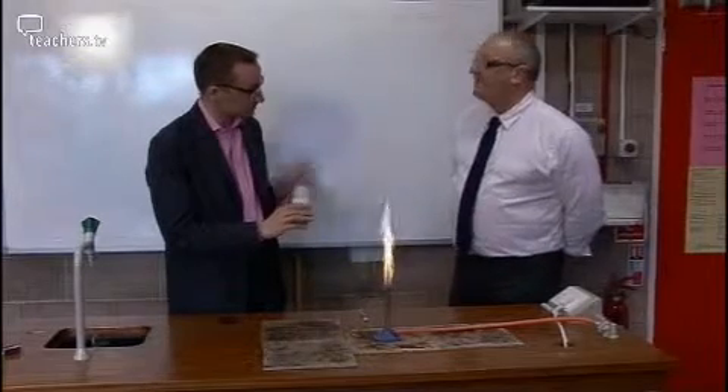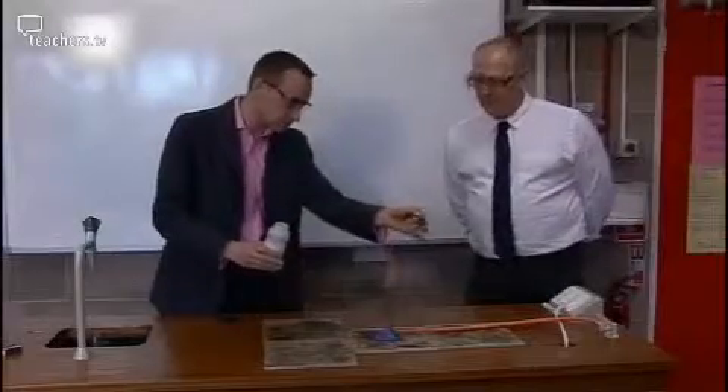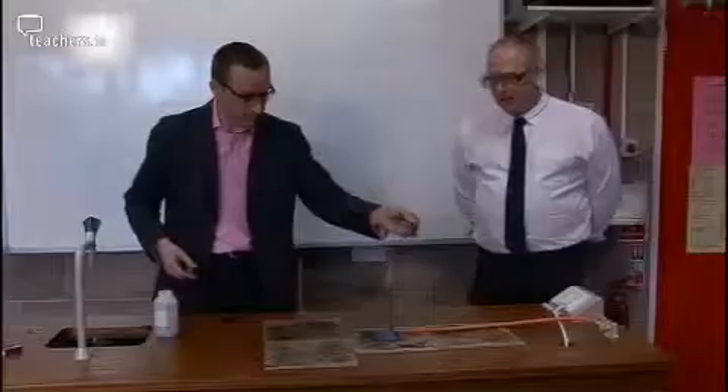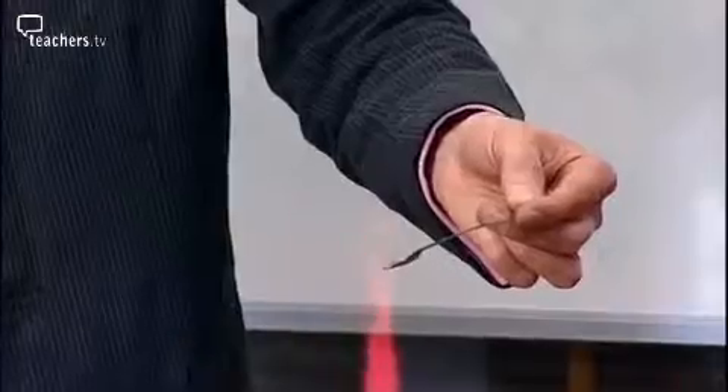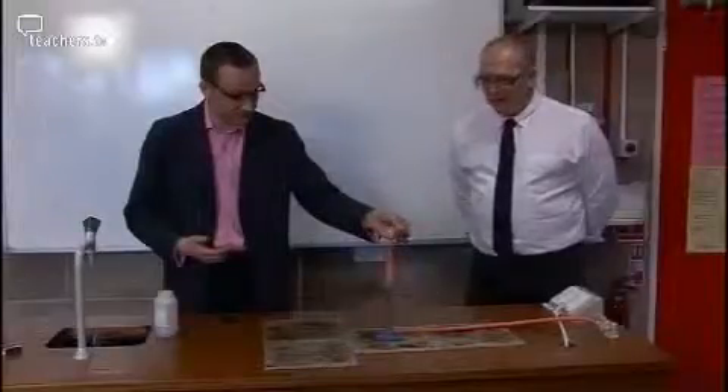Iron filings — very fine ones. We're just going to hold the spatula over the top and very gently allow the iron filings just to roll off. So really just a little bit like that — literally just going to hold. In fact you can already see it starting to take effect. It's sparking really well. Isn't that lovely? So we're not clogging the bunsen up and that's really important.